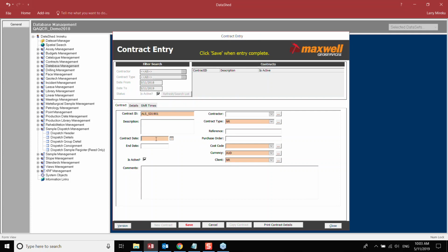Here is where we enter the duration of the contract. Companies might establish a 1 year contract, 6 months contract, whatever type of contract length, so that you know that the prices for your services are at least fixed within the calendar year or your budget year for the company. We will choose the dates 1st of January. We'll pretend that we're in 2018 and we're planning this for 2019. So this is the 1st of January 2019, and then we'll go all the way to the 31st of December.